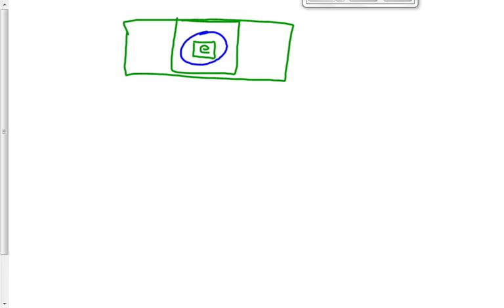So for the letter E, when you're making a wet mount, here's what you do. You're going to take a blank slide, which is just a rectangular piece of glass like this green thing here, and you're going to lay it flat on the table, and you're going to cut out a lowercase letter E from a regular print size article from a newspaper. There's a newspaper sitting up on the front table and some scissors. You'll just cut out from an article a small lowercase letter E. You'll place that on the slide. Obviously, it's not that thick, I'm exaggerating. Make sure when you put it on there that it's right side up as you look at it.